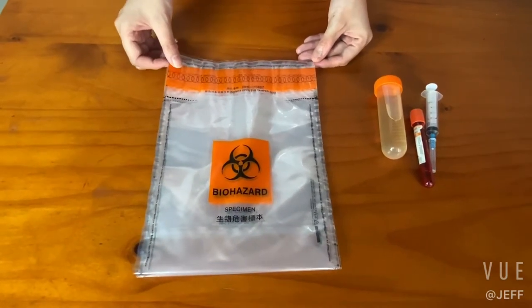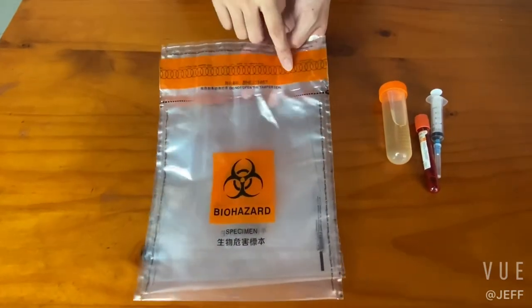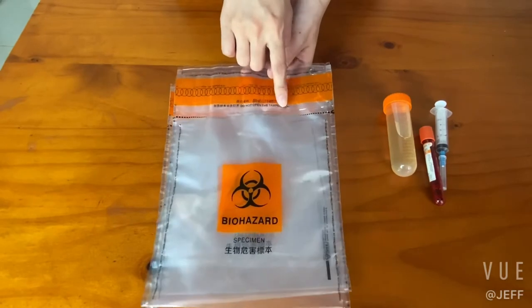We can see its high-level security tape here. It can provide a tamper-evident function if it is torn open. And here's the patented leak-resistant design under the tape.